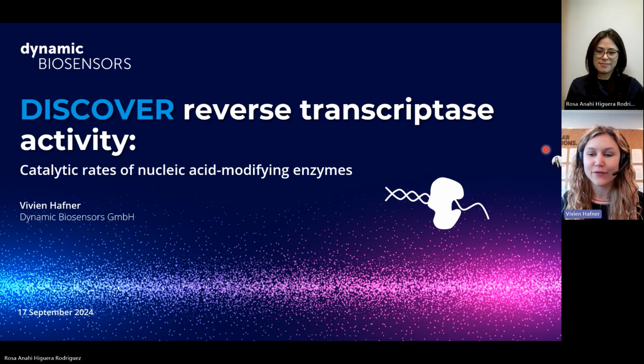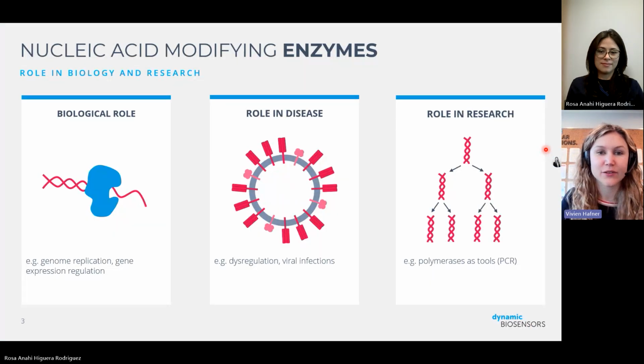And now, without any further ado, I will jump right in, and we will talk today about catalytic rates of nucleic acid modifying enzymes, for example, reverse transcriptase activity. And I would like to start by quickly giving an introduction on why we should at all care about nucleic acid modifying enzymes and why it is interesting to look into their catalytic activity.